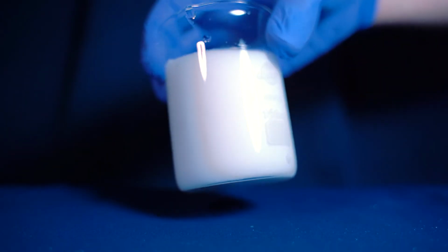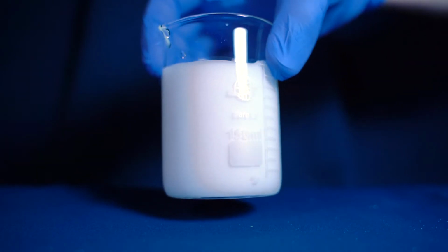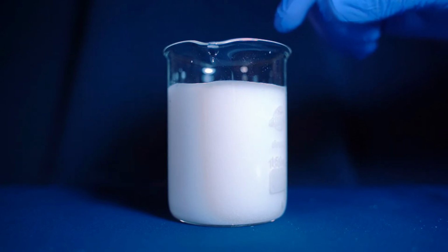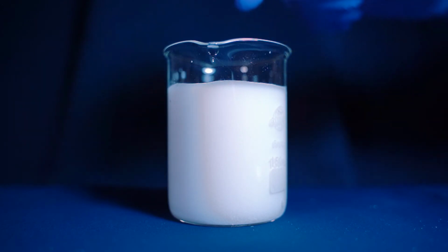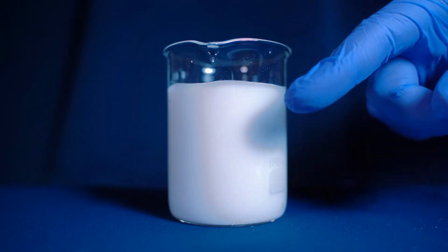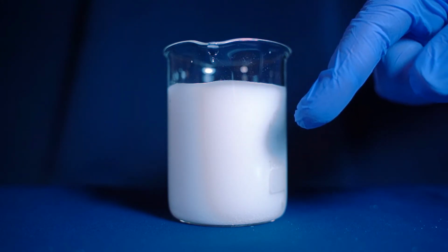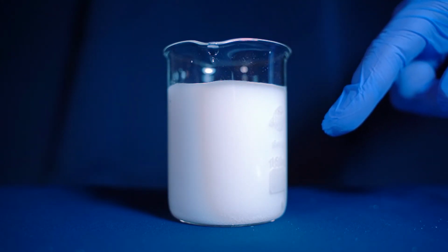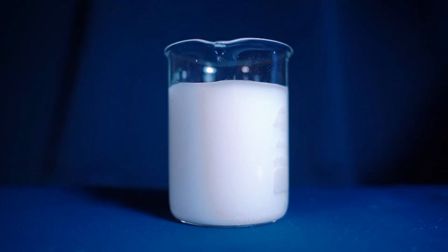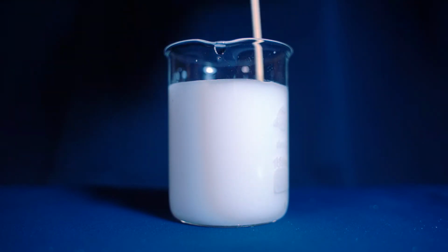Check that out. Now it's a white, milky, cloudy solution, which by definition is not really a solution, because now there's undissolved solute, and that is the lead sulfate that's making it all cloudy. So now it's no longer transparent, and no matter what I do, just like before, I cannot dissolve the rest of this. This is solid.